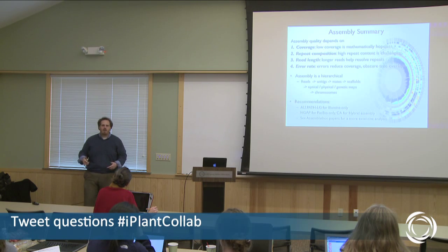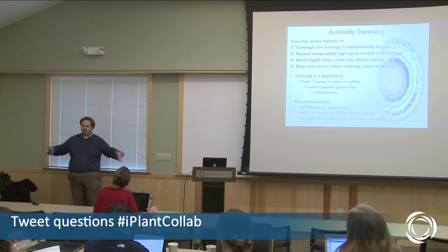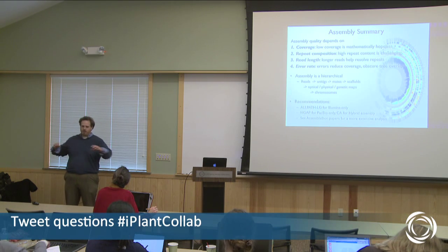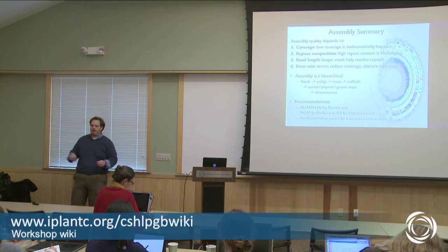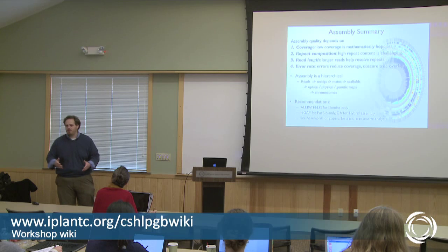About the most successful presentation I've ever seen about dealing with heterozygosity was at Genome Informatics here a couple weeks ago, from Jason Chin at PacBio, where they're using their extra long reads and very, very deep coverage. They were assembling yeast and Arabidopsis that was heterozygous, and you get this really nice assembly where you actually get the nice bubbles that you expect, representing the two haplotypes that are correctly assembled. So I think you've exactly identified the research frontier. That's a problem that I'm really interested to work on. So if you have data of that type, please contact me after. We can talk about what the options are.